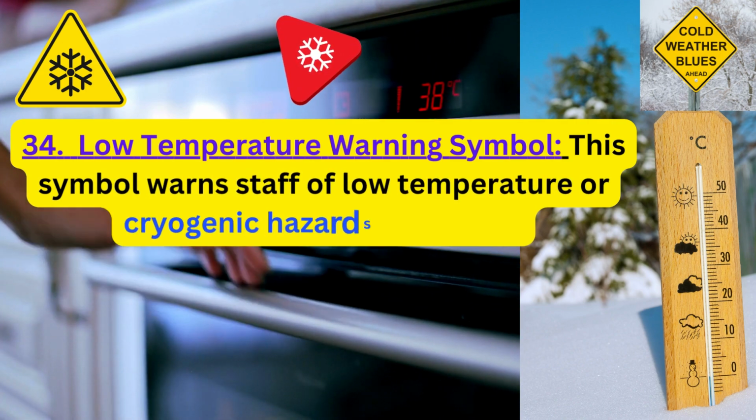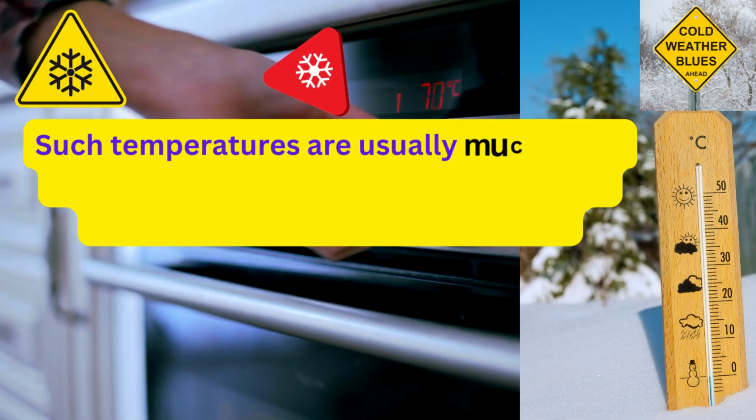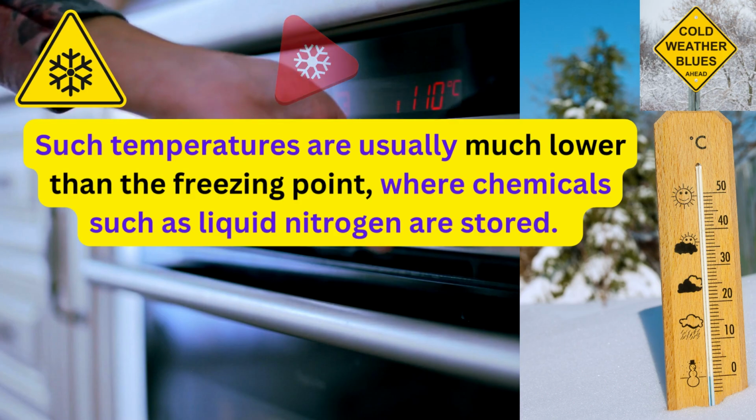34. Low temperature warning symbol. This symbol warns staff of low temperature or cryogenic hazards in the lab. Such temperatures are usually much lower than the freezing point, where chemicals such as liquid nitrogen are stored.